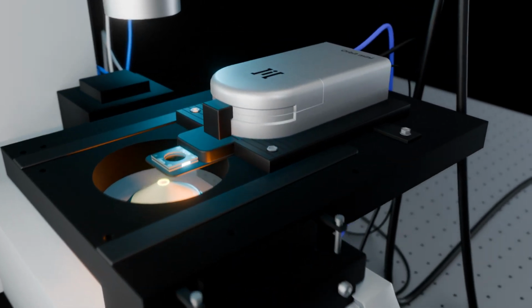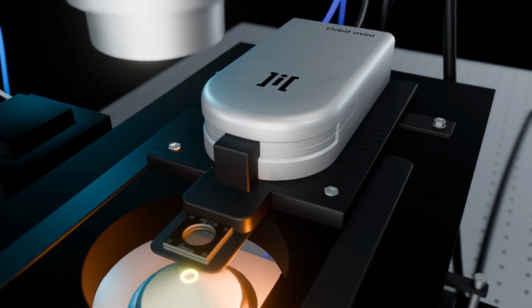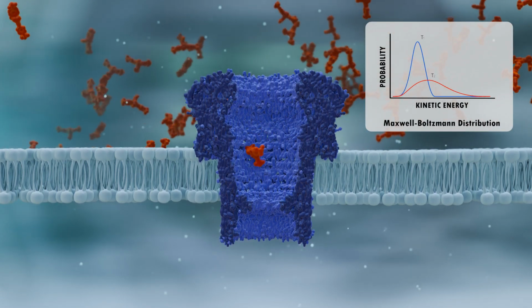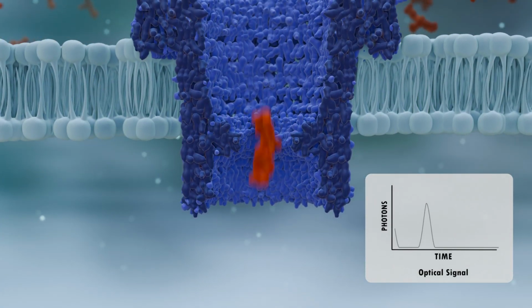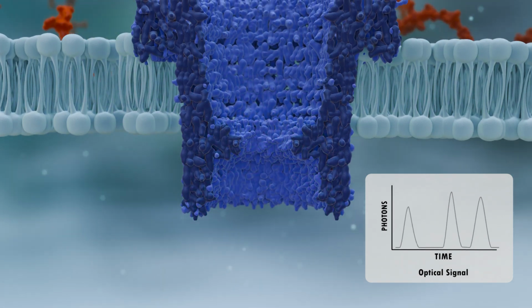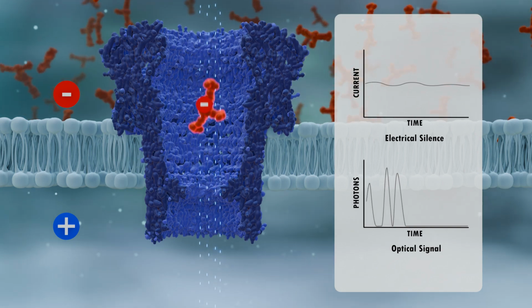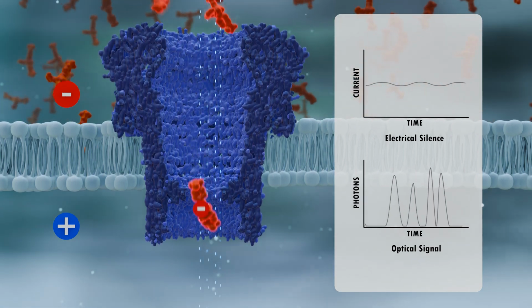Assisted by microchip technology and electronics from Nanion and Ionera, investigators from the Burden lab used a specialized optical microscope to measure light and electrical patterns simultaneously as fluorescent molecules moved through a nanopore. Repeated bursts of fluorescence from single molecules in a focused laser were observed in proportion to the translocation rate. However, when a voltage was applied across the membrane, corresponding electrical patterns were absent, confirming scientists' beliefs.